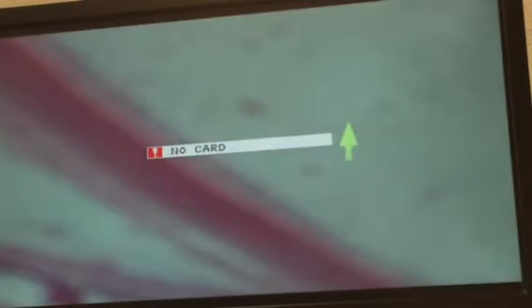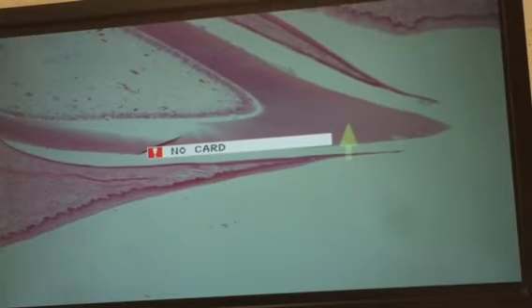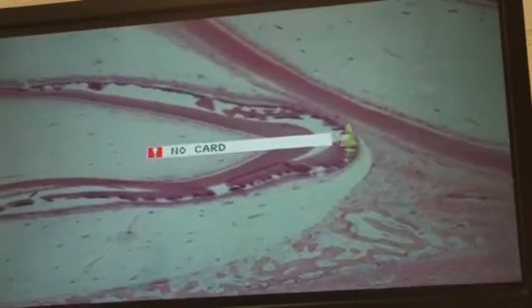For eruption and shedding, really only one, well, two slides maybe in your slide box. We see a tooth that is beginning to erupt. In fact, the enamel has already poked through. And as we come back down, we can see right next to it, we have a permanent tooth that is developing. And right over here, here's another permanent tooth. Why are there two down there?